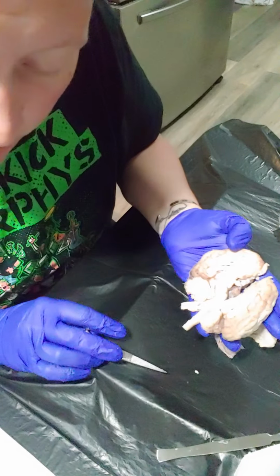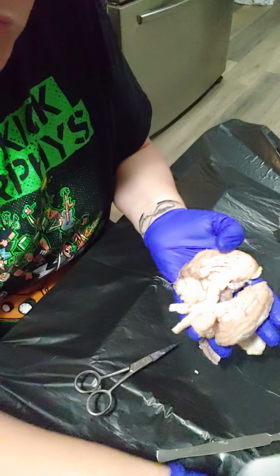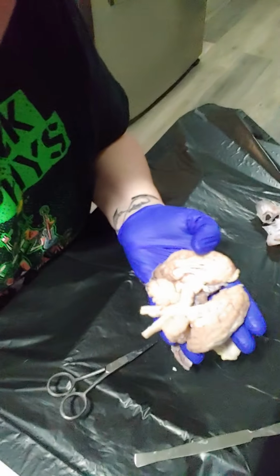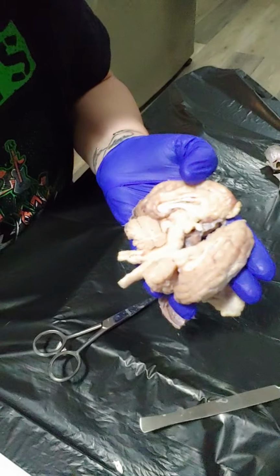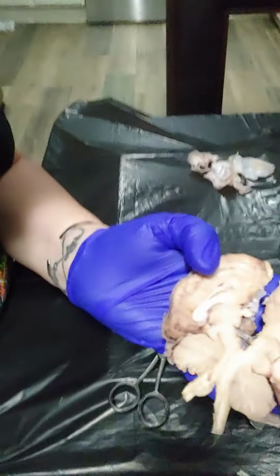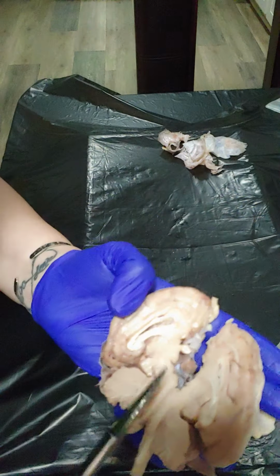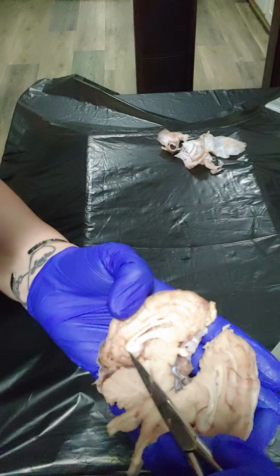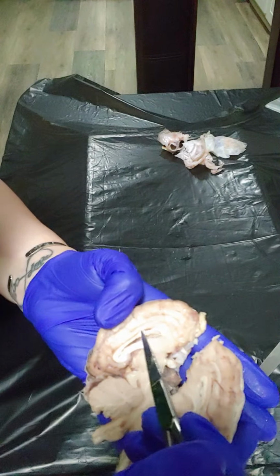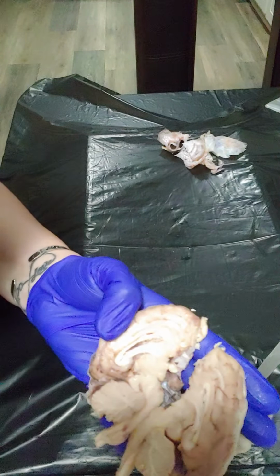Your corpus callosum is going to be this white loop. It's terrible glare. I don't know how to bring it in where you can see it a little bit better. That might help. So this structure right here, this is the part that connects the left and right hemispheres, a bundle of fibers. It is the corpus callosum.